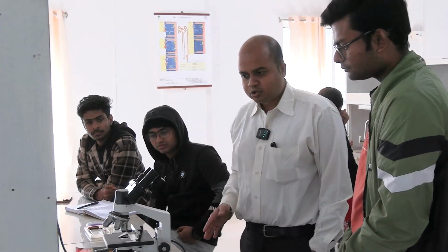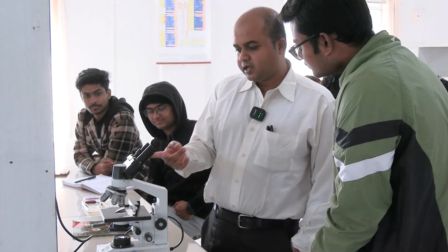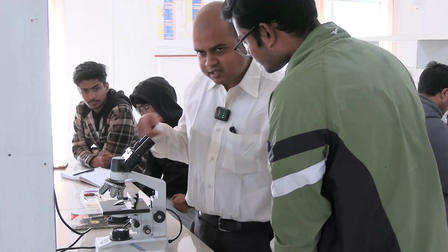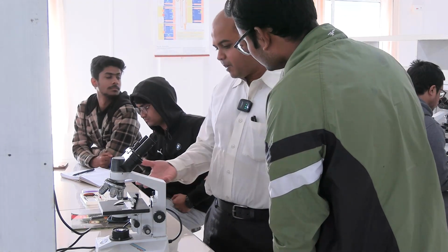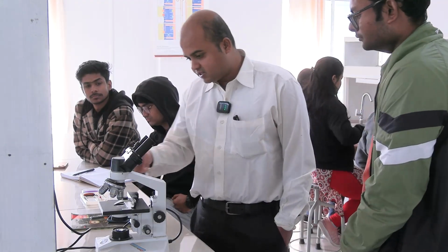For these types of microscopes, you have to practice with two eyes. In microscopes with one eyepiece, you have to learn closing one eye and seeing with the other. But here, after a few days, our eyes have binocular vision. You will see the same thing, but it will take a bit of time to adjust to seeing with the two eyes together.